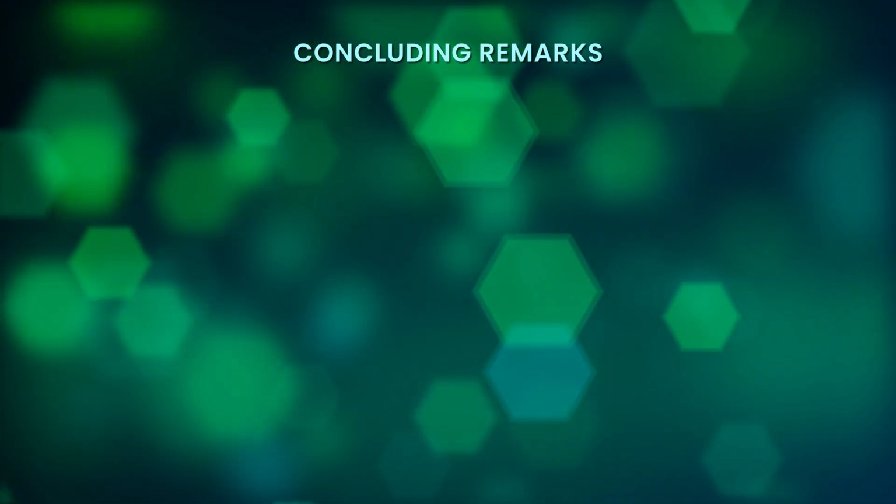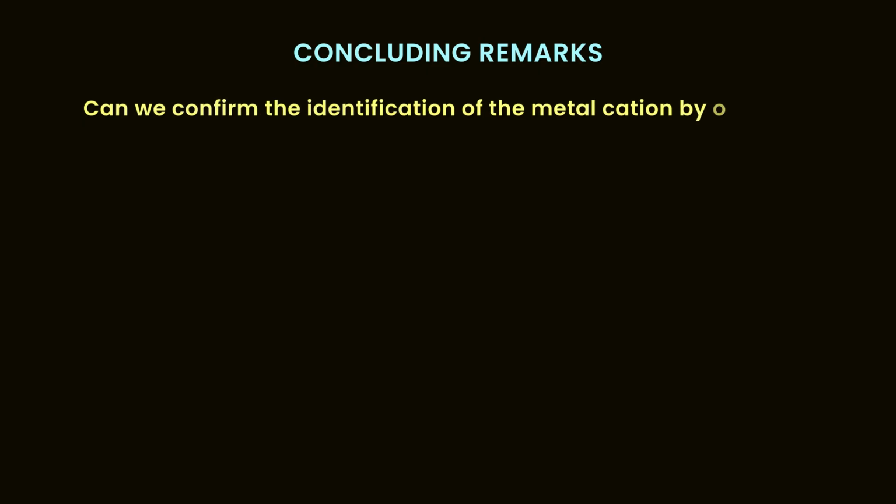Concluding remarks. Can we confirm the identification of the metal cation by only performing the flame test? The flame test has some limitations.